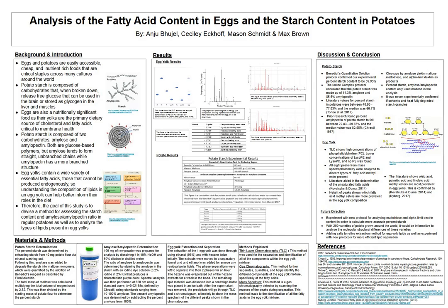So to purely determine how much starch there was in the potato flour, we originally had planned to use a procedure from one of the literature sources that involved using glucosidase to degrade the starch into glucose, and then using spectrophotometry and an equation that they had derived to measure the amount of starch. However, we were unable to get the glucosidase that was required for that procedure, and all we had was amylase, which would degrade the starch to maltose.